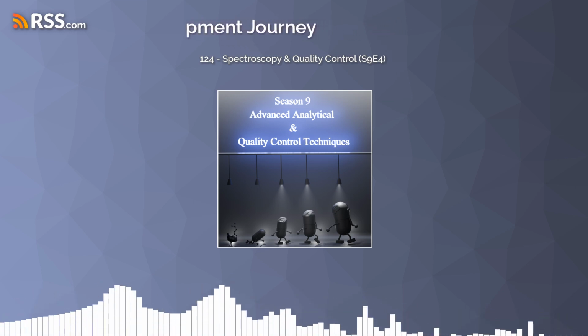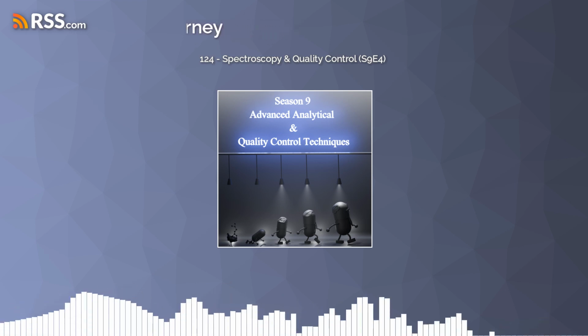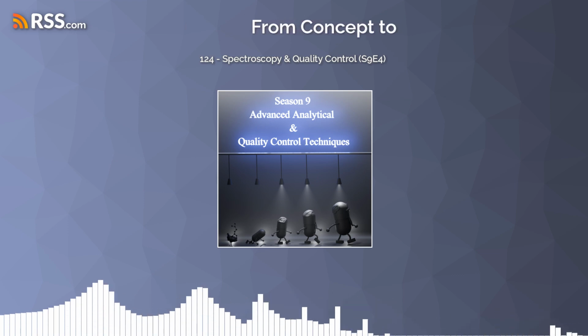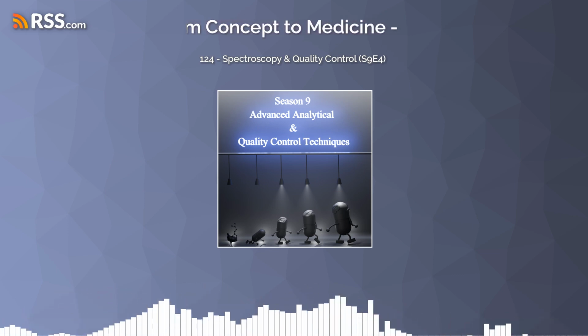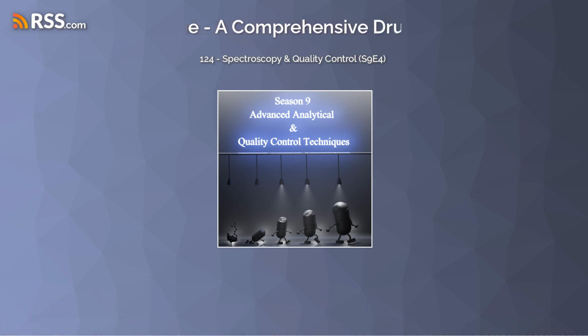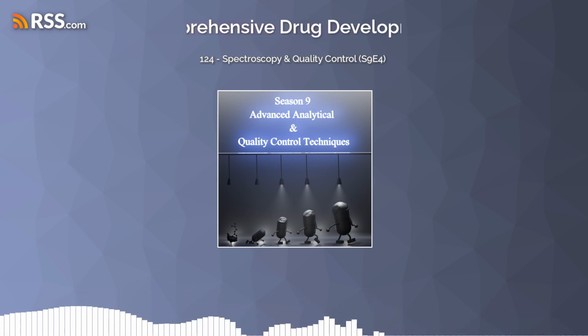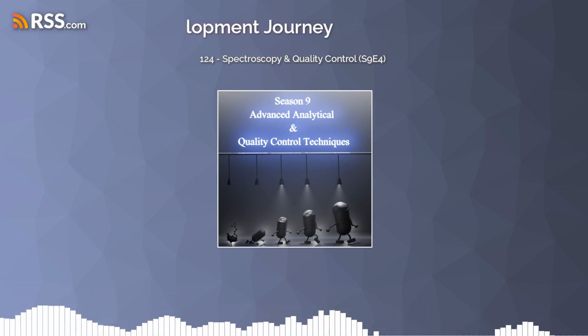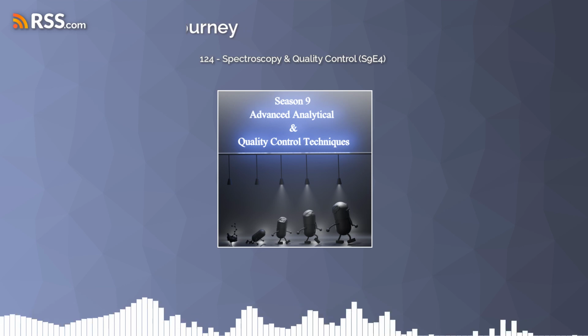And they find that it's missing a key functional group that should be there. That's a huge red flag. It could mean that it's counterfeit or that it's degraded somehow, and so they don't use it. And that prevents potentially dangerous product from reaching patients. So that's a case where IR spectroscopy really helped protect public health.